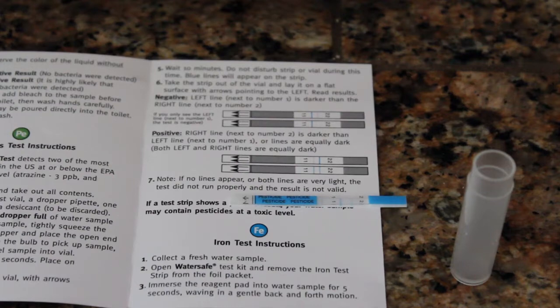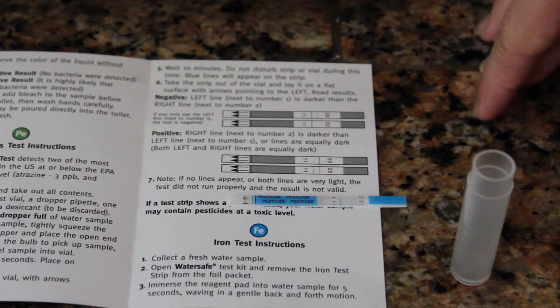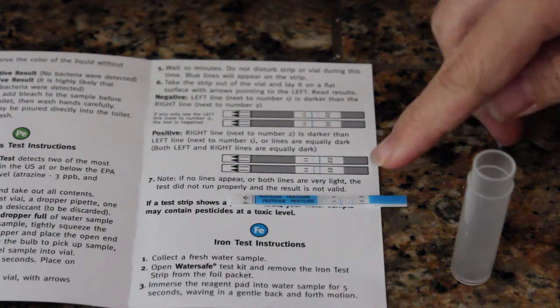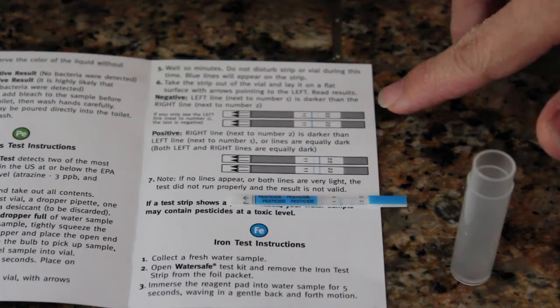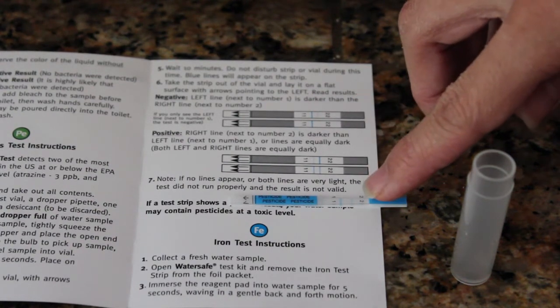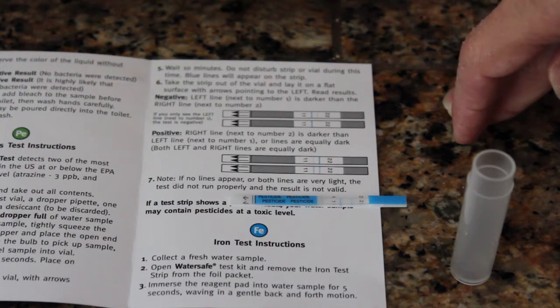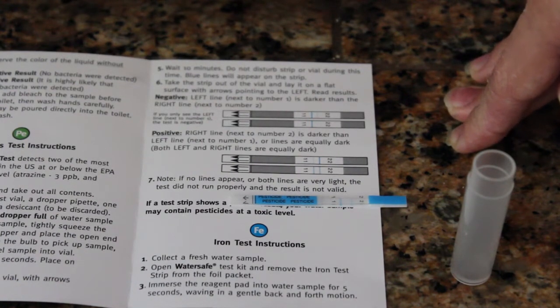It's been 10 minutes. We're going to take a look at our pesticide strip. You want to take it with the arrows pointing to the left as shown in the diagram, and pretty much it's like a pregnancy test — it's got two little lines, and depending on which one is brighter or darker it'll tell you whether you're positive or negative. The first little line is significantly darker than the second line, so that means my water tests negative for the pesticides atrazine and simazine, which is good news. If the second line had been darker, or the lines were roughly equal, that would have meant it tested positive. My water is relatively pesticide free, at least from these two common ones.